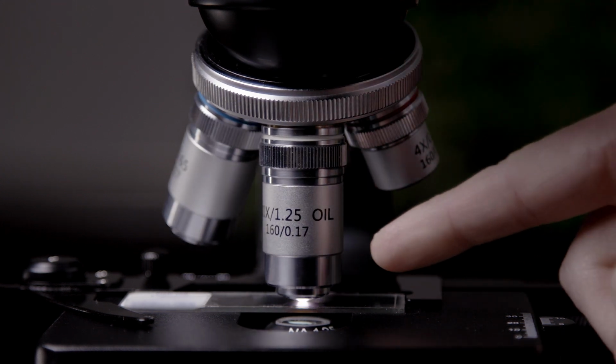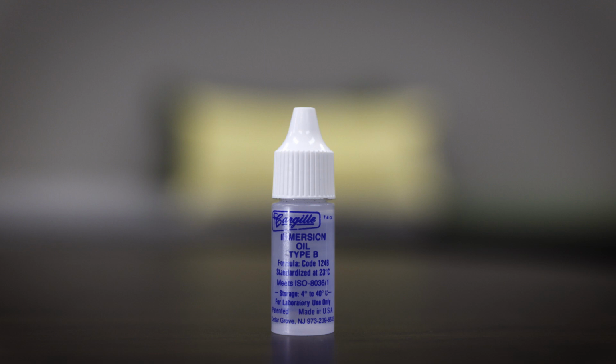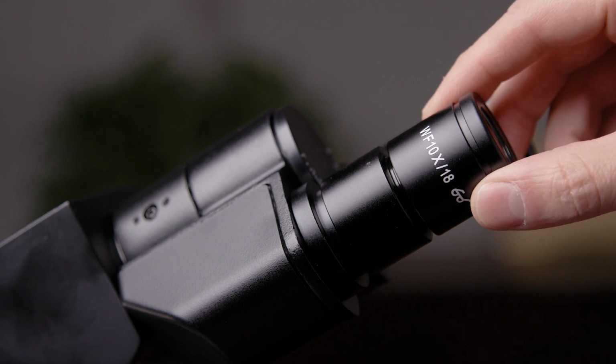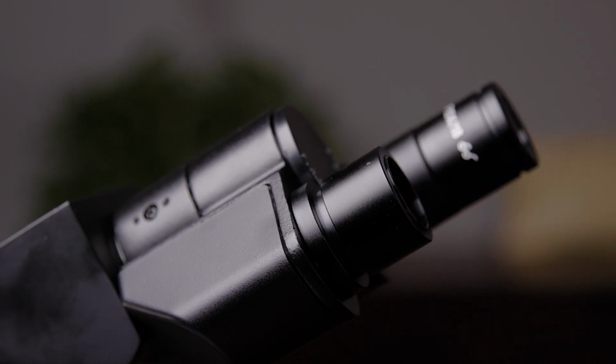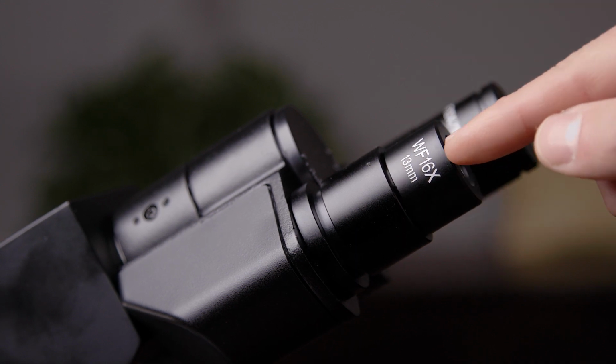The maximum is usually 100 power, and it can be an oil immersion objective. What that means is you need a special oil to put down on the slide to be able for this to work properly. You can also get to a higher magnification by switching up the eyepieces. This one comes with 16 power, and that will get you up to a maximum of 1600 power.